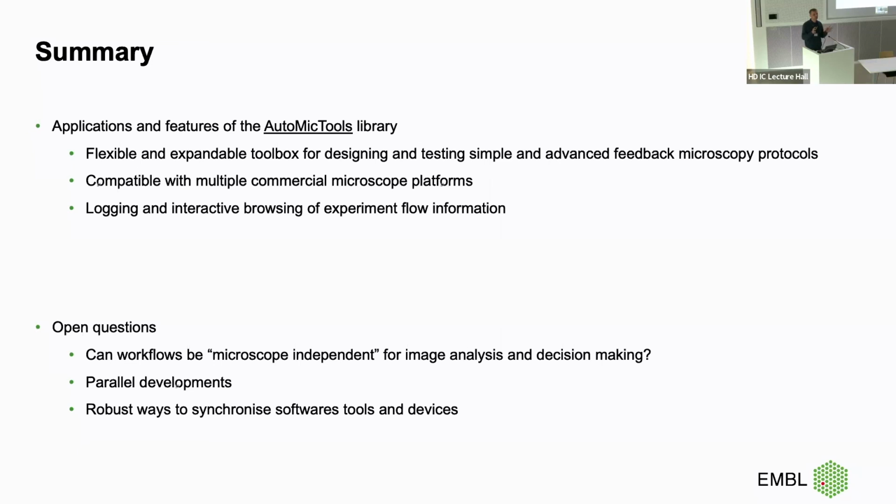And I think a more emerging topic, especially with spatial omics and this type of thing, is synchronizing with external devices like microfluidic devices and pipetting robots, when it's done not on fully customized systems, but on a rather conventional microscope. Can we use the same tool? Can we also use these libraries and have it as another milestone, or would one say it's a completely different set of applications to target?